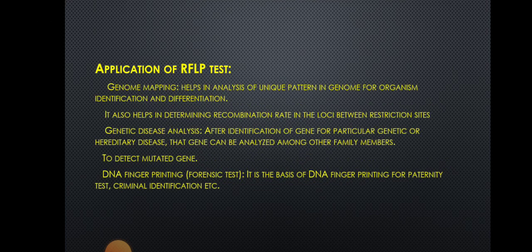Applications of RFLP. Genome mapping helps in analysis of unique patterns in the genome for organism identification and differentiation. It also helps in determining recombinant rate in the loci between restriction sites. Genetic disease analysis. After identification of the gene for a particular genetic or hereditary disease, that gene can be analyzed among other family members to detect the mutated gene.